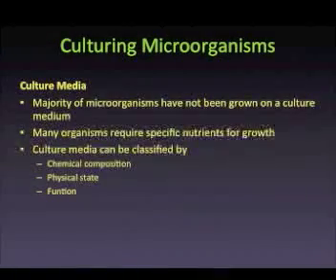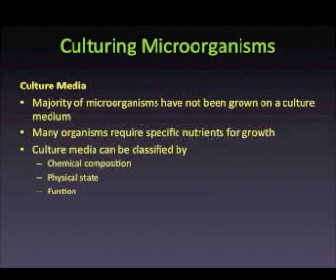In order to cultivate microorganisms in the lab, microbiologists must meet the nutritional and physical requirements of the microorganism. Nutritional needs are met by placing the microorganism on or in a nutrient medium. Some microorganisms' needs are more easily met than others. Some microorganisms require specific nutrients and growth factors, making their cultivation more challenging.